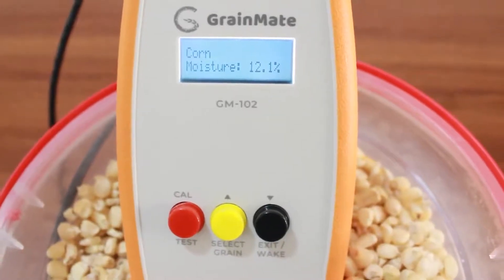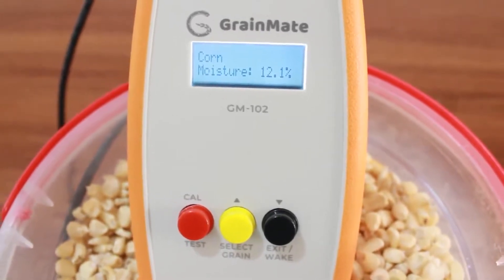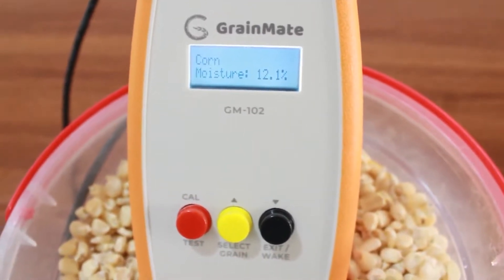After about two to three minutes, the results from the test and the moisture content are going to be displayed on the screen. And that is how to test for the moisture content. Thank you.